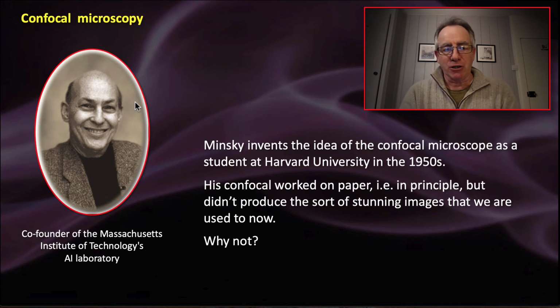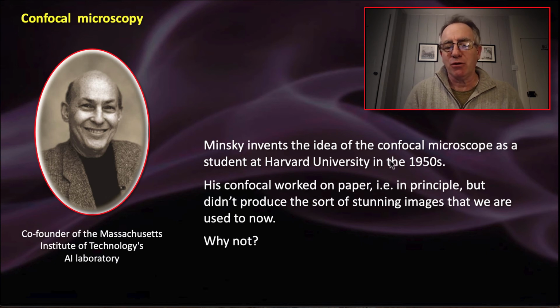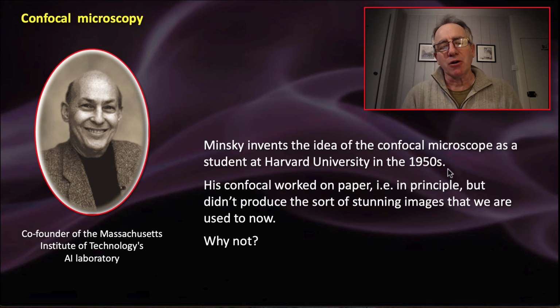Let's go back. Let's do a bit of a history lesson here. This guy, Marvin Minsky, I see I cut his first name off there. Poor Marvin. Marvin Minsky invented the confocal microscope while he was a PhD student at Harvard University way back in the 1950s. But confocal microscopes weren't made commercially until the 1990s, 40 years later. And that's because he was a smart guy.